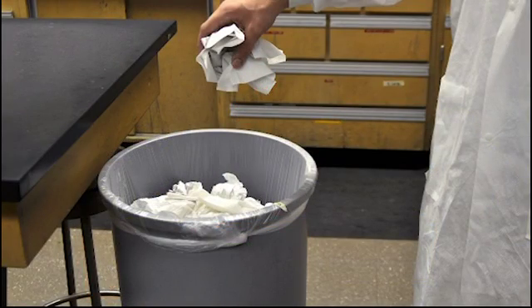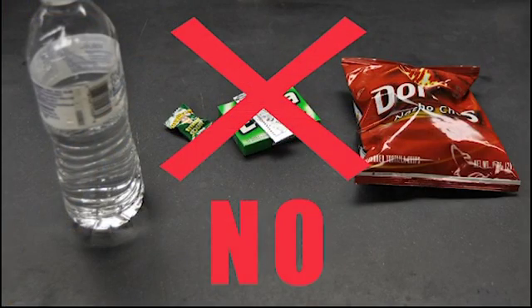Rule number 10 also reminds you that non-biohazard materials, such as paper towels used to dry hands and unwanted note paper, can be placed in regular trash containers. Rule number 11. This rule requires you to develop and use a good, safe, personal aseptic technique. Avoid any hand-to-mouth activities. Do not smoke, eat, consume drinks, chew gum, or place any objects in your mouth. Don't apply cosmetics or handle contact lenses while in the laboratory.